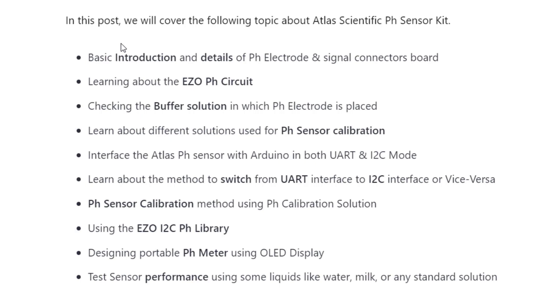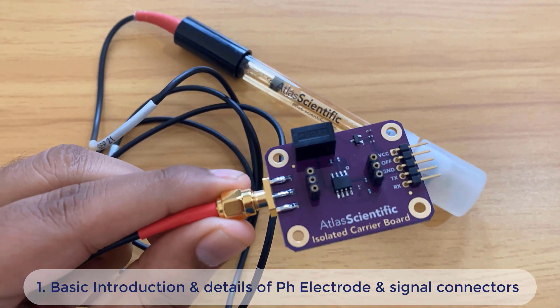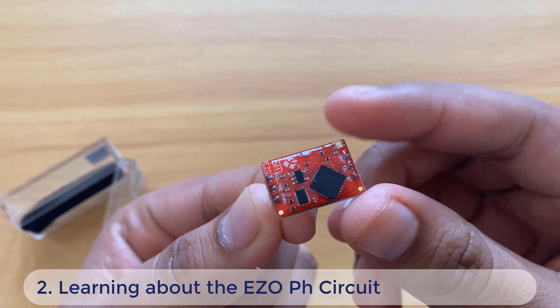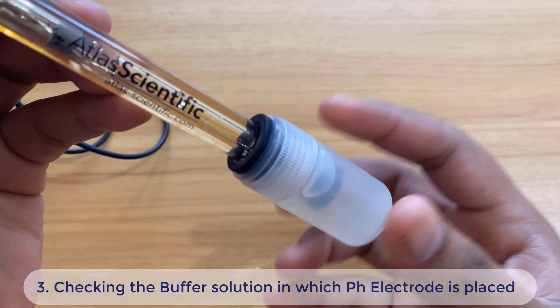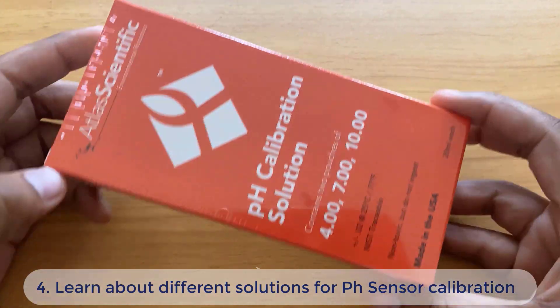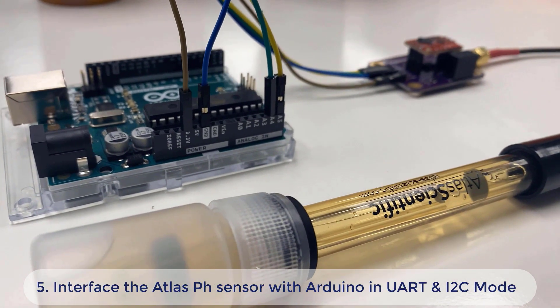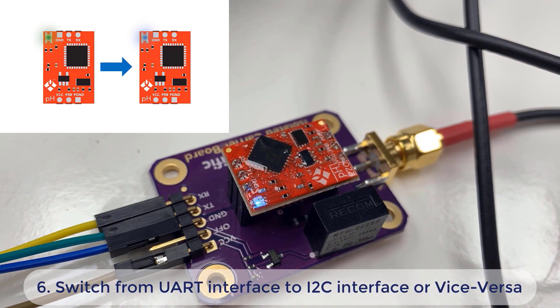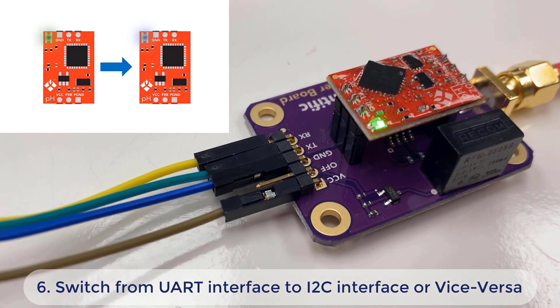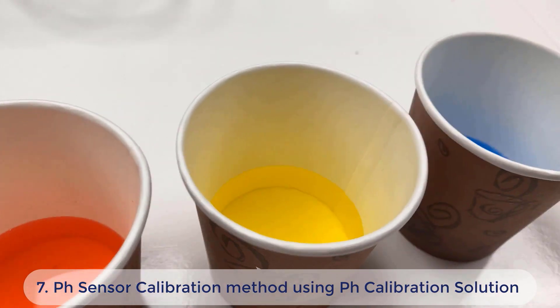In this video, we will cover the following topics about the Atlas Scientific pH sensor kit: a basic introduction and details of the pH electrode and signal connector board, the EZO pH circuit board, the buffer solution in which the pH electrode is placed, and the different solutions used for pH sensor calibration. In the project part, we will interface the pH sensor with Arduino in both UART and I2C mode, and learn how to switch between the two interfaces.